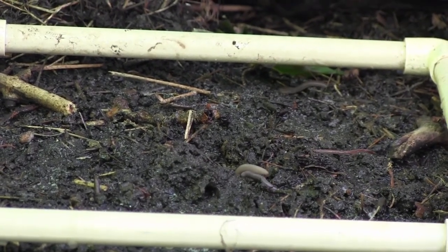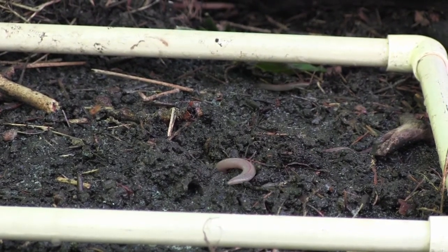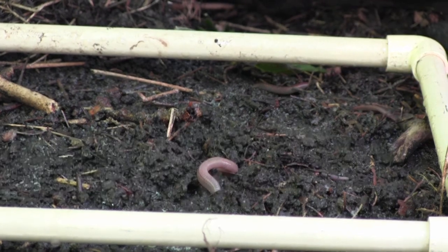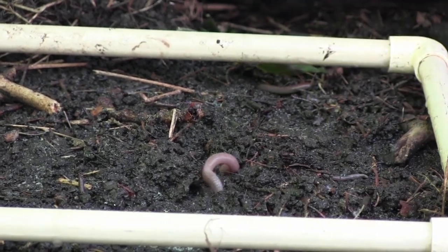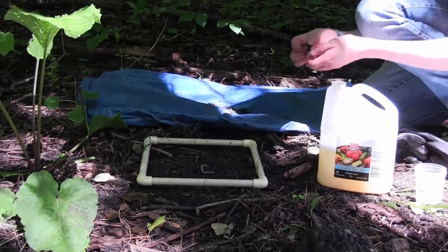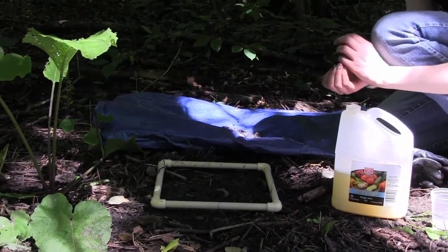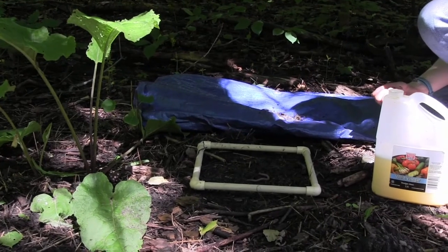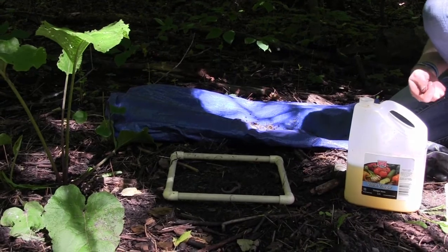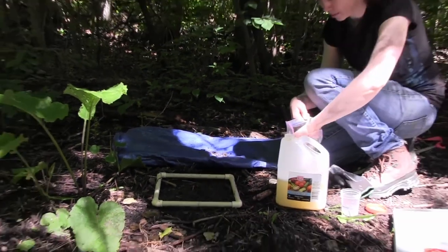So it's important to let them come out of the soil entirely before you pick them up, because they'll grab on with their tails otherwise. So here I've got 3 little earthworms so far. And you can see a big one emerging from the burrow that I had pointed out in the middle of the plot before. And now he's totally out of the soil, so I can pick him up.